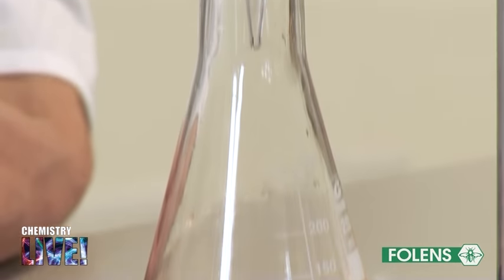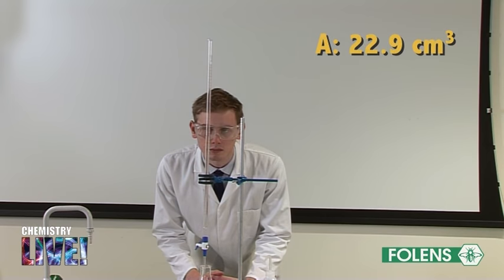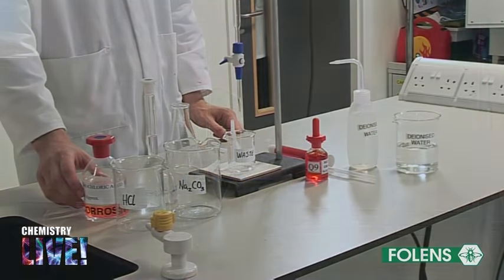For example, if the three titration readings are 22.9 centimeters cubed, 22.4 centimeters cubed, and 22.5 centimeters cubed, the titration figure to be used in the calculations is the average of 22.4 centimeters cubed and 22.5 centimeters cubed, that is, 22.45 centimeters cubed. The method of calculating the concentration of the hydrochloric acid solution is shown in your textbook. This concludes the experiment.